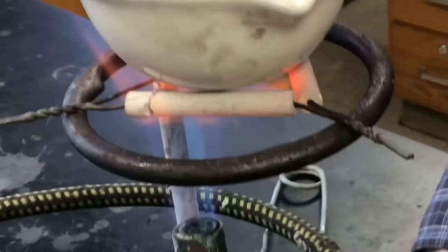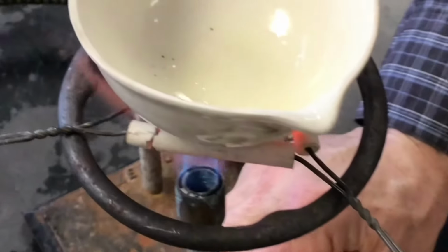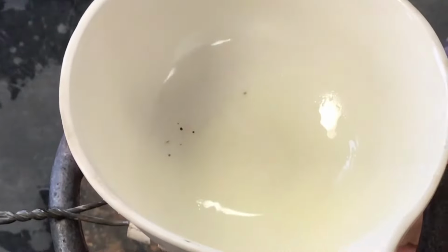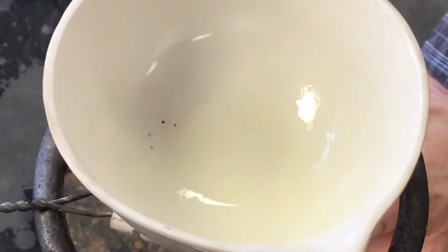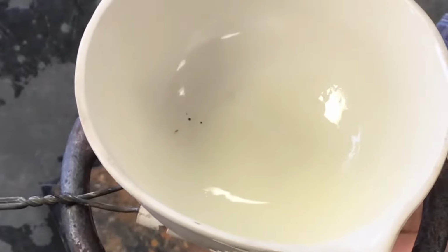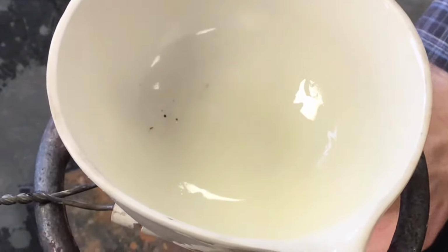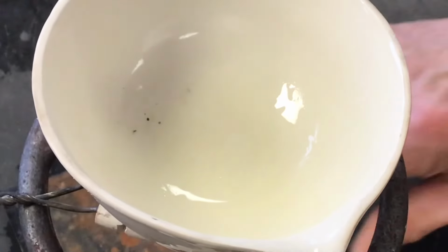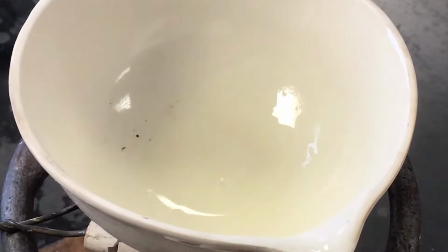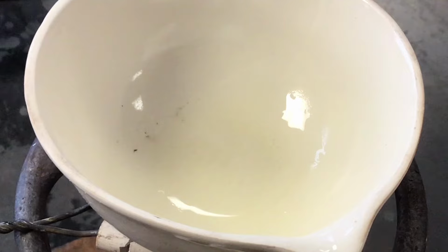Yeah, it gets nice and hot down there, as you see. Red hot. So yeah, the bubbling is the oxygen going away. And this is really cool because once all the oxygen is gone, then we have just potassium chloride in there, and it goes back to solid. That's how we know that it's done. Potassium chloride apparently has a higher melting temperature, so it just solidifies.